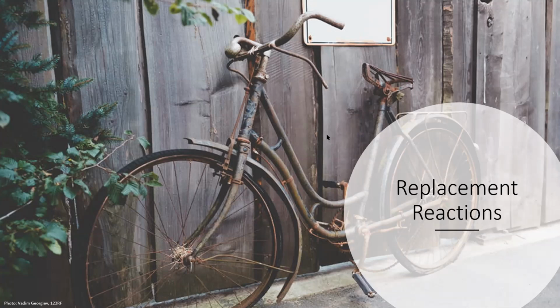When metal rusts, that's an example of a chemical reaction that is a single replacement reaction. So that you can identify by a color change. Now, what else do you see here is some leaves. And so some of these leaves have a little bit of brown in them, a little bit of yellow. So that is a color change.